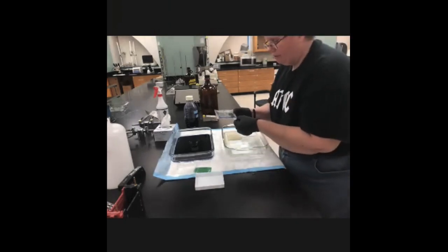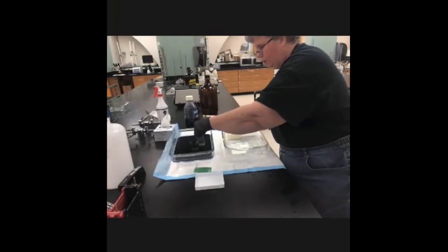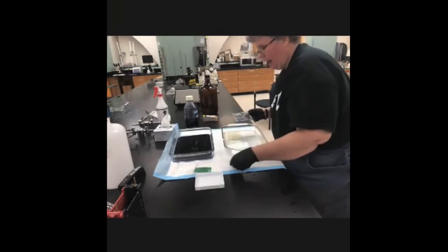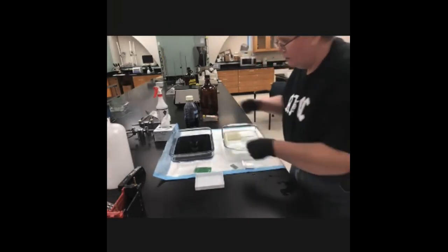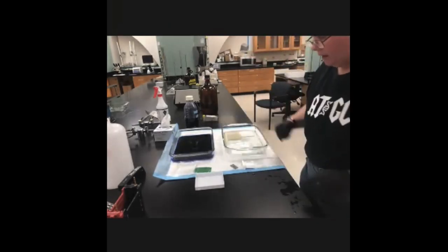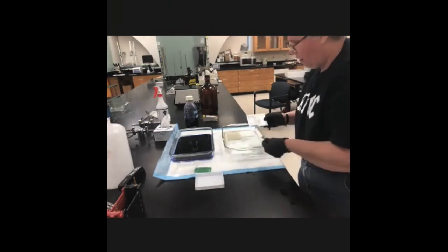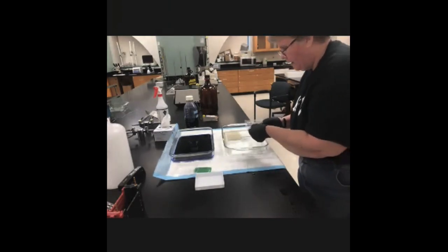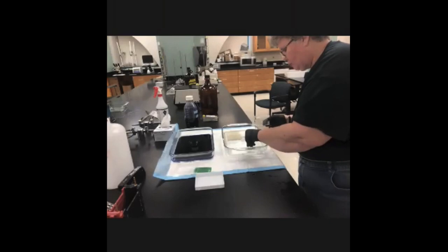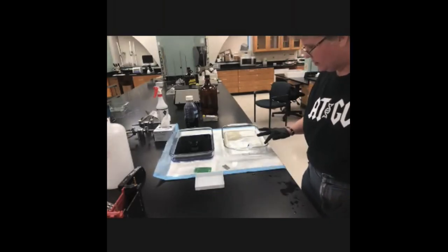Now, half the gel can go into the Coomassie blue dye, and the Coomassie blue dye will stain every single protein that's in there. The other half of the gel is going into our transfer buffer, and it needs to soak in the transfer buffer for approximately 40 minutes.